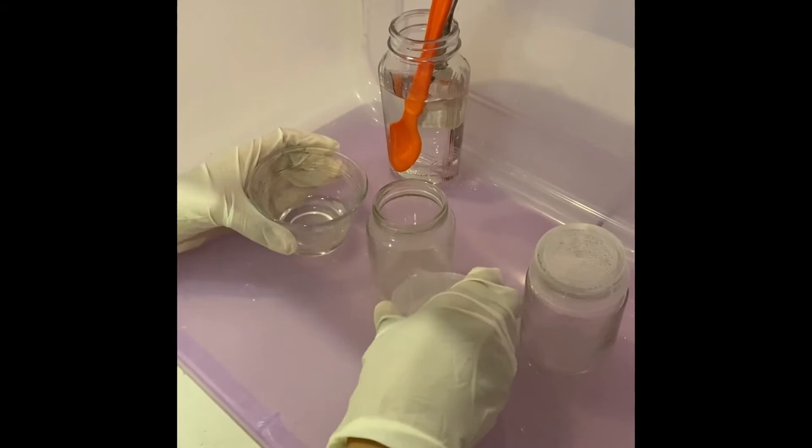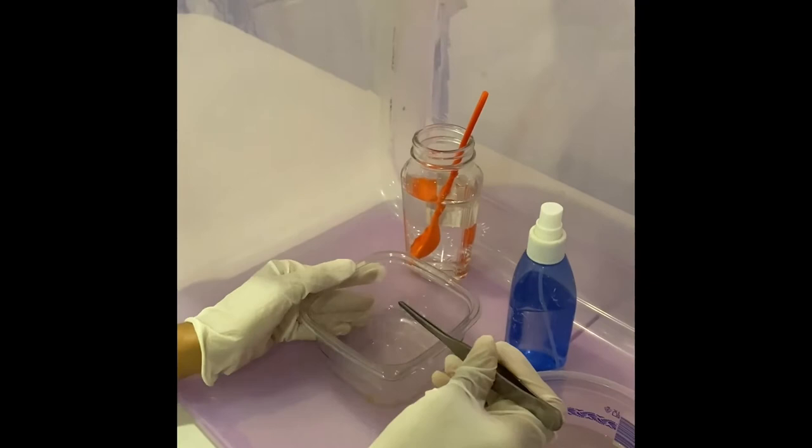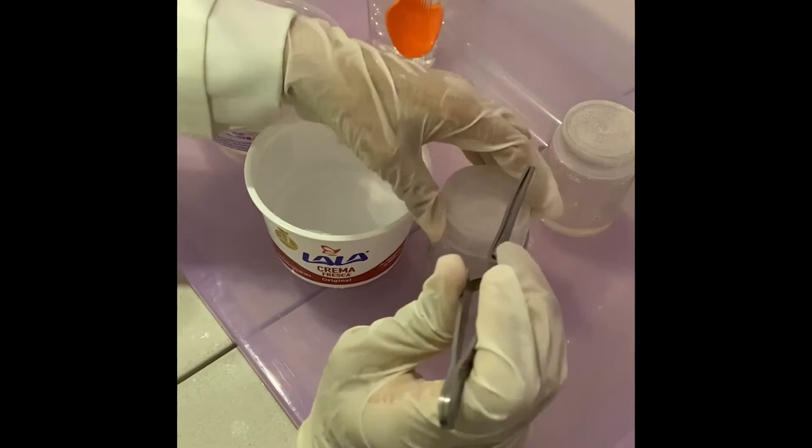After this, I started the seed disinfection process. I left the seeds in 70% ethanol for 3 minutes. Then I passed them to bleach for 7 minutes and finally rinsed them 3 times in water. Finally, I placed them inside the flask. During this process, it is important to use a disinfected tweezer and avoid touching the inner part of the flask.